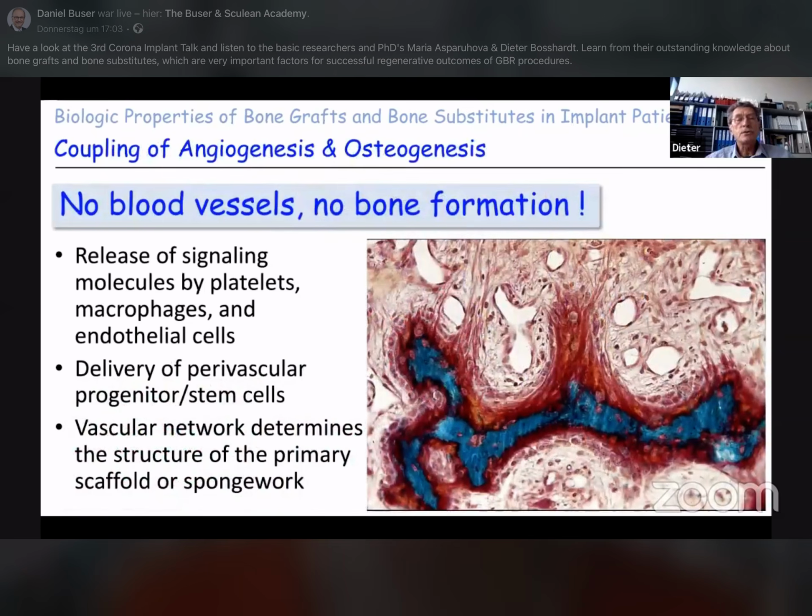Now, what also was shown by Bob Schenk beautifully, because he had such nice, crisp, clear histological pictures. This is one of these pictures here, also coming from this study, where you see a beginning bone formation. It's woven bone formation here. In green, the mineralized bone. And then in red, which is the equivalent of the osteoid. This is the direction of growth from here upwards.